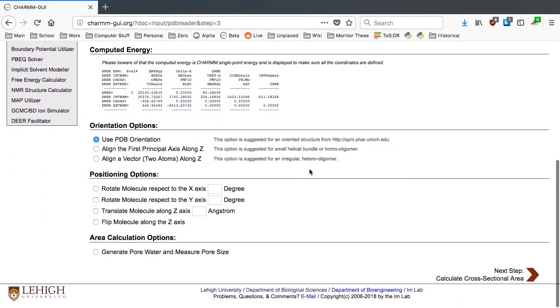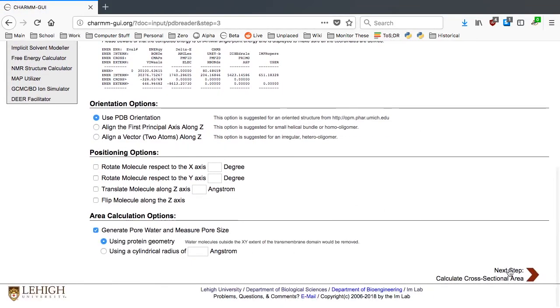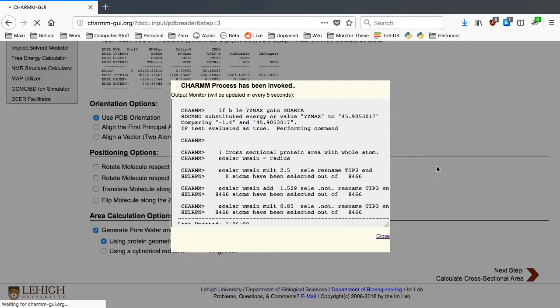To generate the pore water, activate the Generate Pore Water and Measure Pore Size option. Click the next button.